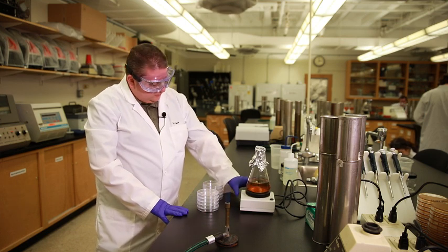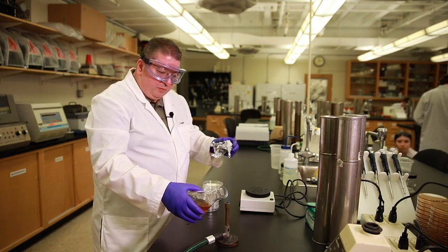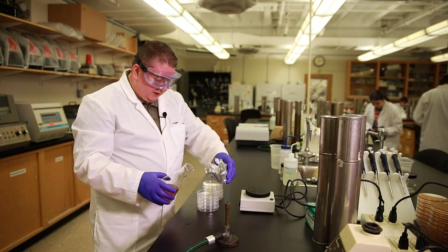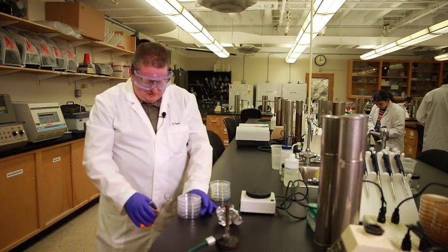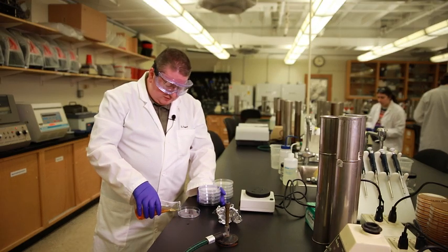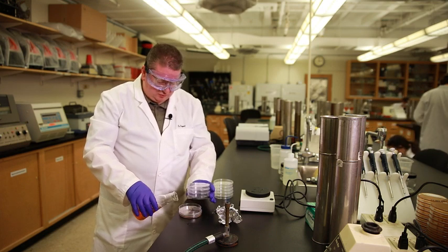So the agar is stirred enough now. What I'm going to do is take my little foil cap off and then run this opening through the flame of the Bunsen burner. That decontaminates that opening so that we remove any airborne contaminants. What I like to do is have my petri dishes on the edge of the bench, have the flask at the same level. I take a lid off of one and I pour this so that I just fill the bottom and then stop. That's about 25 milliliters of the melted nutrient agar.